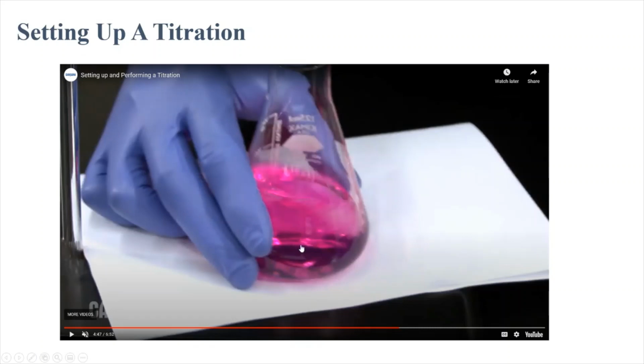And what he said, and he said this quickly, was that because it's so bright pink, there must be an excess of the titrant. And that is true. The more sodium hydroxide you add, the more pink the solution will get after you get past the equivalence point. We're going to talk about this in more detail in a few slides. So what he's done here is he's not using the data for this titration to determine the unknown concentration. They just figured out that you have to add about 10 mL.